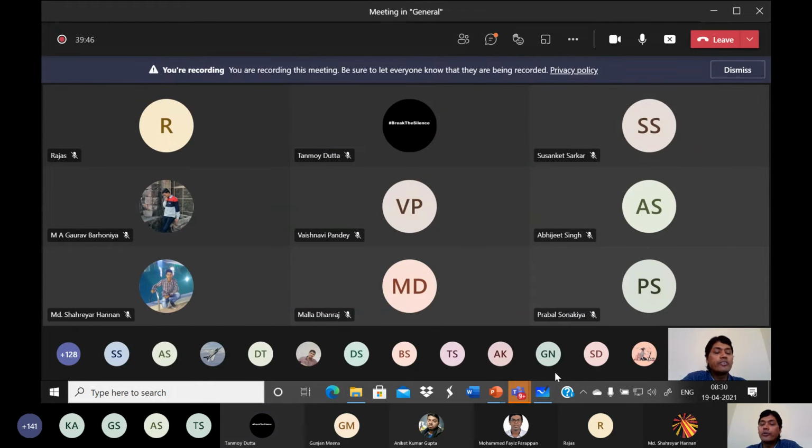Tanmay, normally 94 degrees is too high. When we discuss TM, the melting temperature of DNA curve, you will see 94, 95 is too high. Any DNA will be melted.